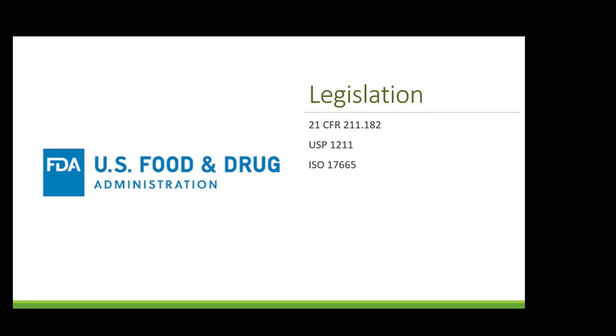Equipment validation documents are evidence that it conforms with the required standard of good manufacturing practices. It guarantees that the equipment consistently provides products of necessary quality.